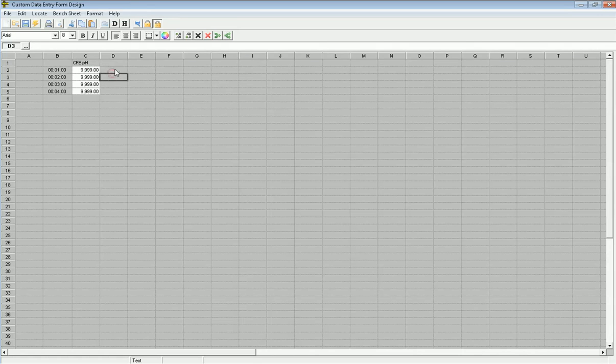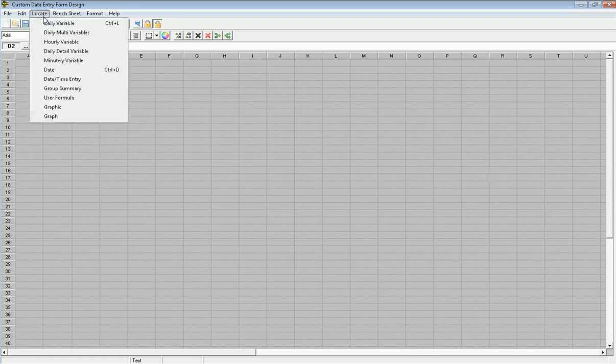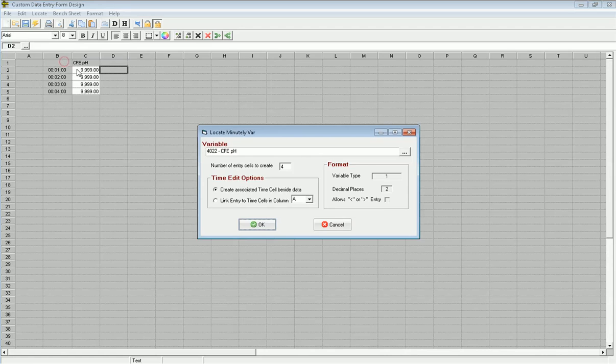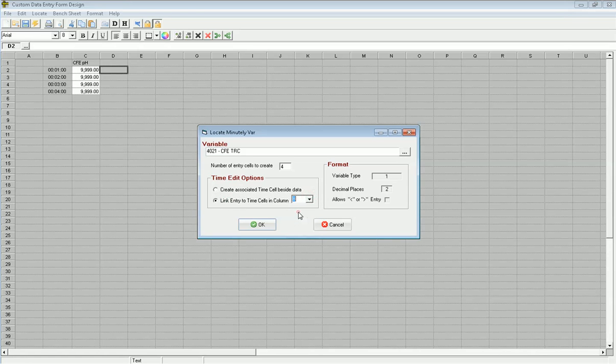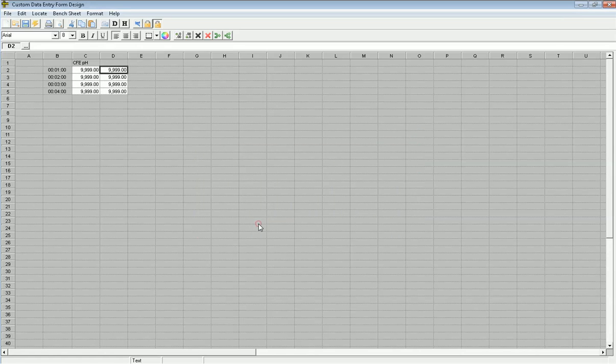And in this case, I need to write down that this is my CFE pH. And right beside it, I can locate four more variables, four more minutely data slots, I should say, for that other variable. But in this case, I'm going to say, listen, when I take the sample, I take them and I do them together. So I don't need a separate time. So I want to link it to column B. So it'll link D2 to B2, D3 to B2, so forth and so on. Go ahead and click OK.